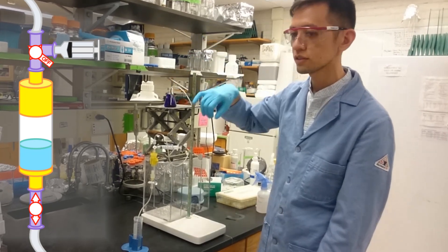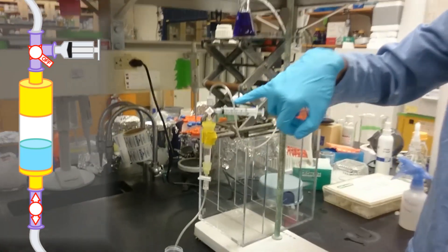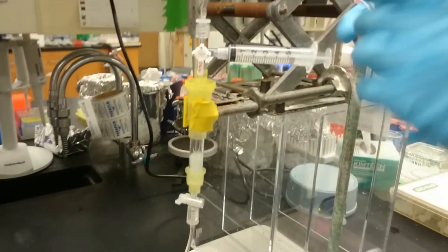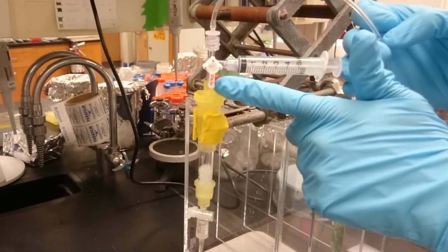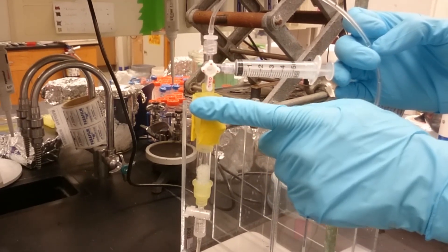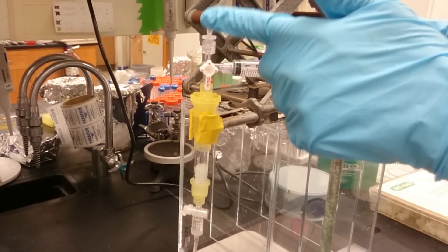Let's take a closer look at what's going on up here, because this is really the important part. This three-way valve — we're going to start with it in the off position, so closed off to the column.